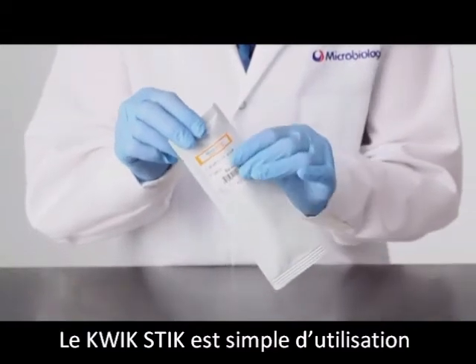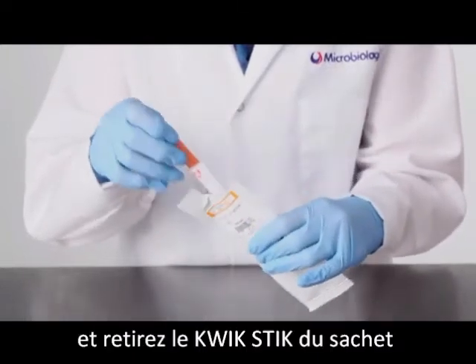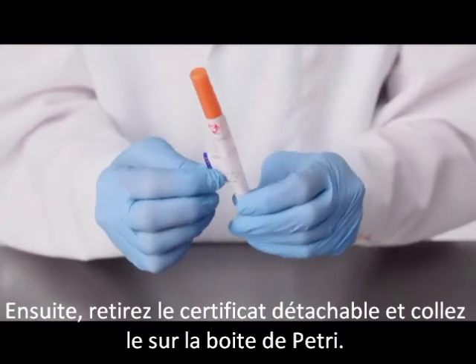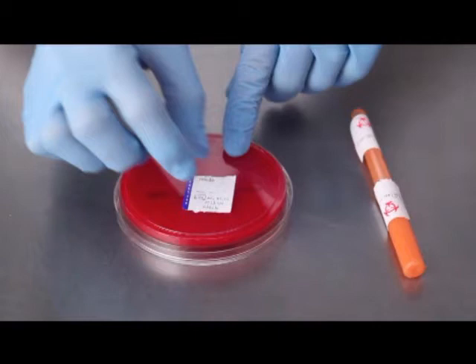The quick stick is simple to use. To get started, tear open the foil pouch and remove the quick stick device. Next, remove the peel-off label from the quick stick and attach it to the agar plate.